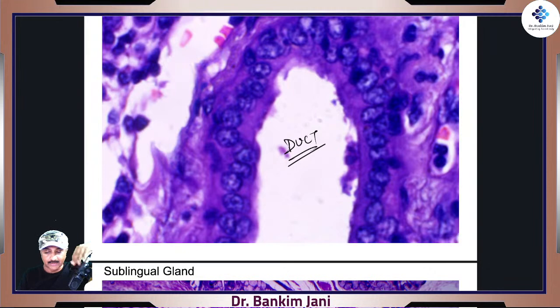So in this duct, see how amazingly fine. The best example of superbly rounded nucleus, right? And so nicely dark stained, absolutely fantastic. And over here, though they are seen so nicely, can you see the cell wall? No, the cell wall is not seen, right? So how beautiful all of us are from inside, right?